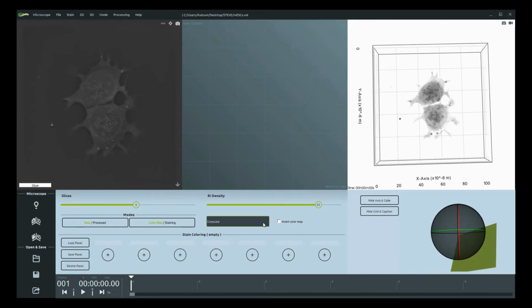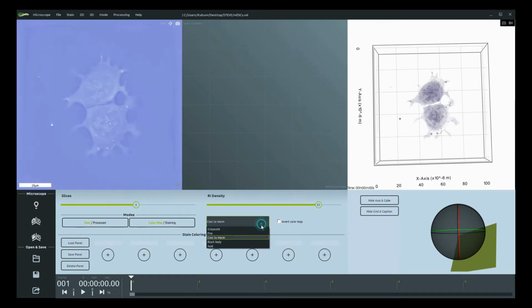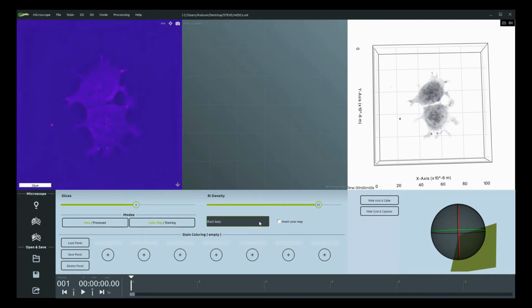This gradient is conjugated with a selection of color maps. The eye perceives different colors with different levels of accuracy, so sometimes using a color map makes some details stand out that would otherwise go unnoticed.